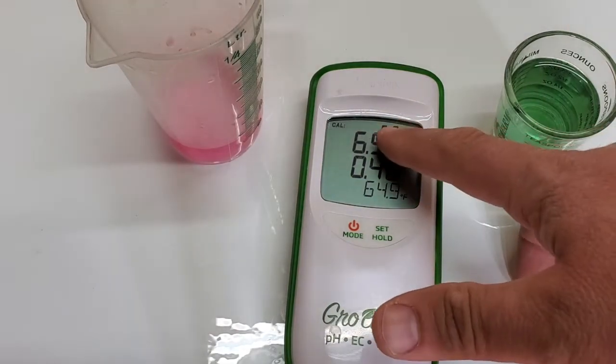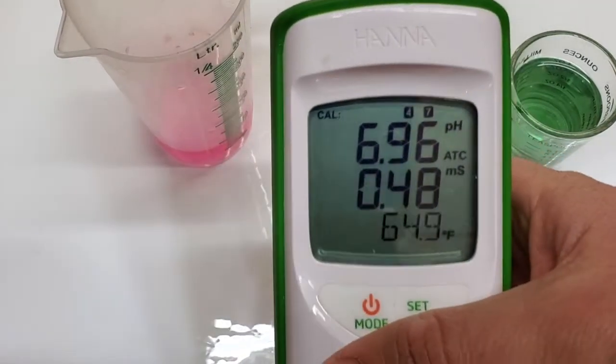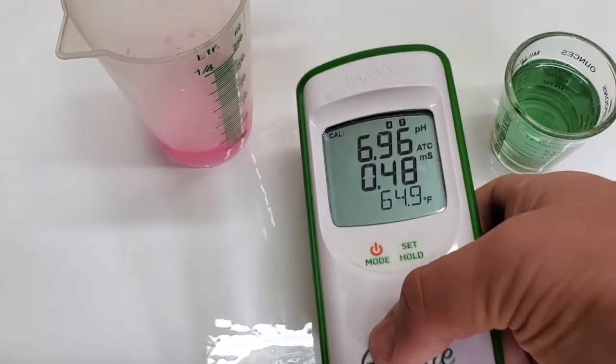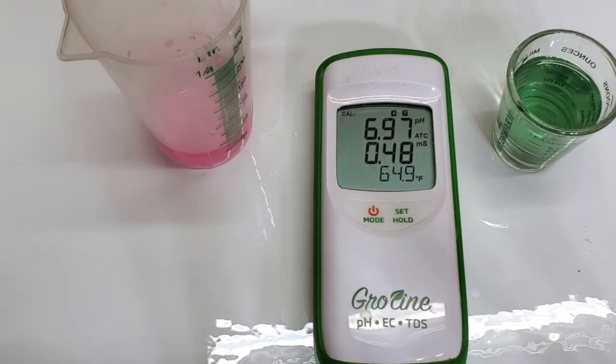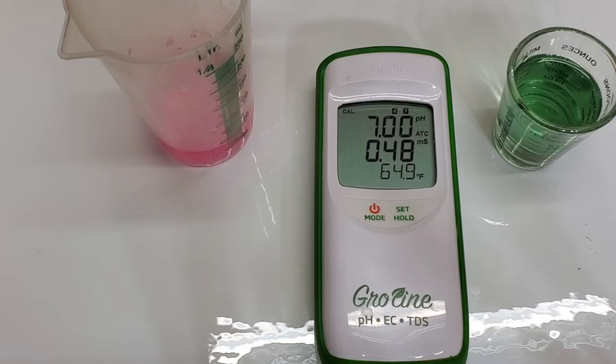It also tells you up here that the calibration is in the 4 and 7 — those two little indicators over the top — so you know if you're in standard or quick calibration mode; this would be standard. Now the timer has quit blinking, so you know this is about as accurate as it's going to get: 7.0, and 0.48.